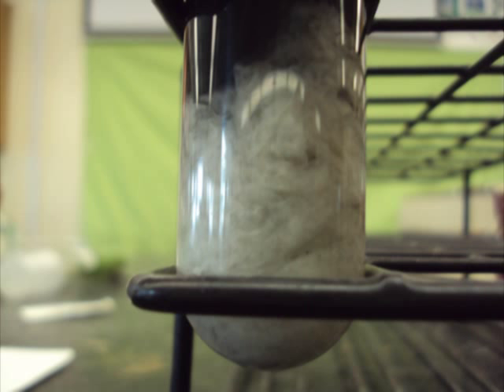Clostridium breaks down the cellulose into glucose, which it ferments to produce a range of simple organic compounds such as ethanol, acetic acid, succinic acid, acetone, butanol, etc. Desulfovibrio reduces sulfate into large amounts of hydrogen sulfide, which, when reacting with any iron in the sediment, produces black ferrous sulfide. The hydrogen sulfide travels up the column and is used by other organisms.